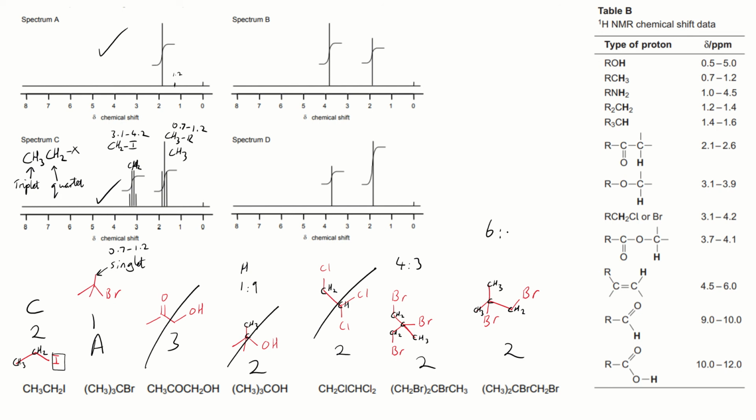So we've got 6:2 or a 3:1 ratio. So if we look at our integral lines, we can see these are roughly equal. This one on the left is a bit bigger if I sketch that along, since it looked to be starting at roughly the same point. So that's going to be our 4:3 ratio, whereas down here you can see this one is much bigger than this line. So we've got the 3:1 in there.